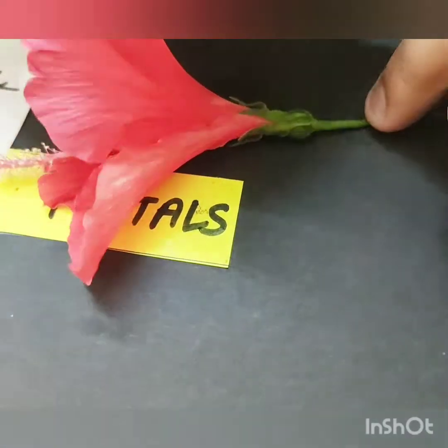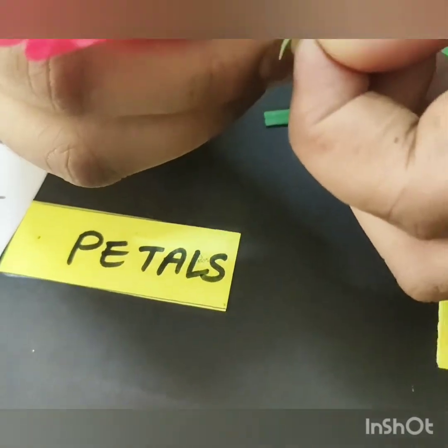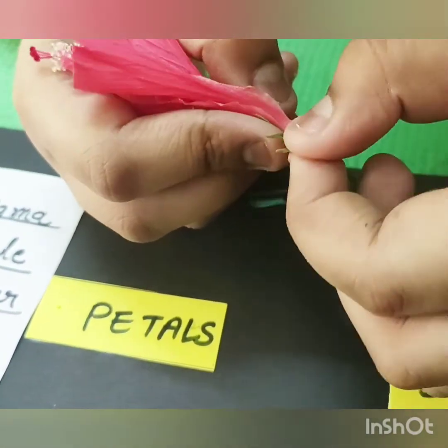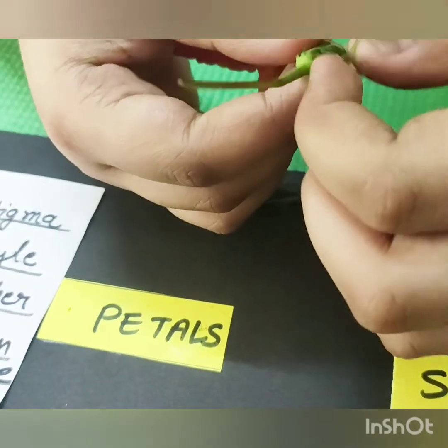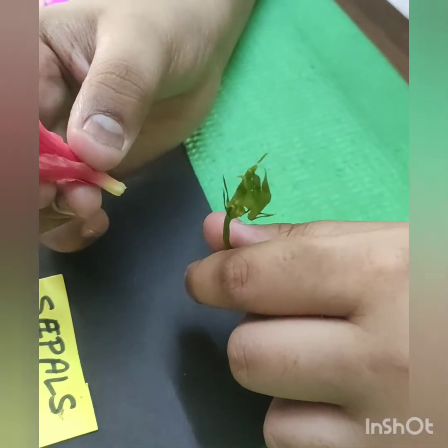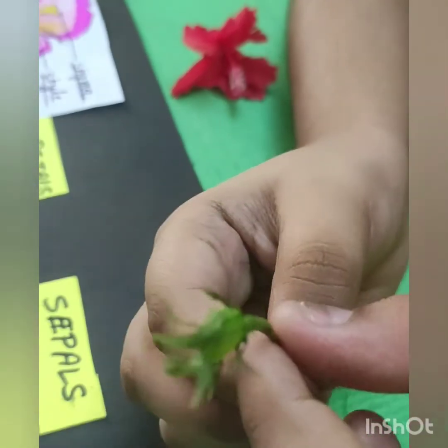First, we have to remove the sepal. The sepal is the green part of the flower. The sepal is very important for the flower — it protects the bud. This green part is called sepal.